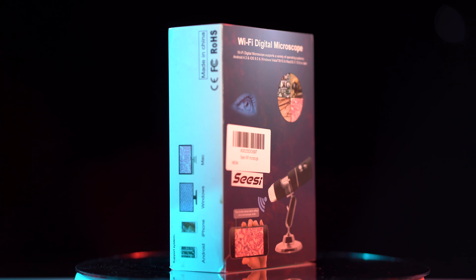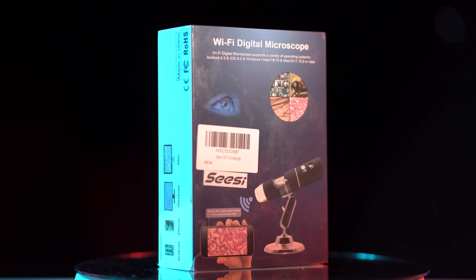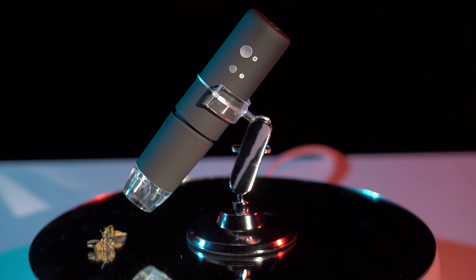Hey everybody, welcome back to another episode of LCR. This is David, and today we're talking about a microscope which you can use to see closely to little things such as bugs. We did do some demonstrations on some bees, which you can probably see in this video right now.